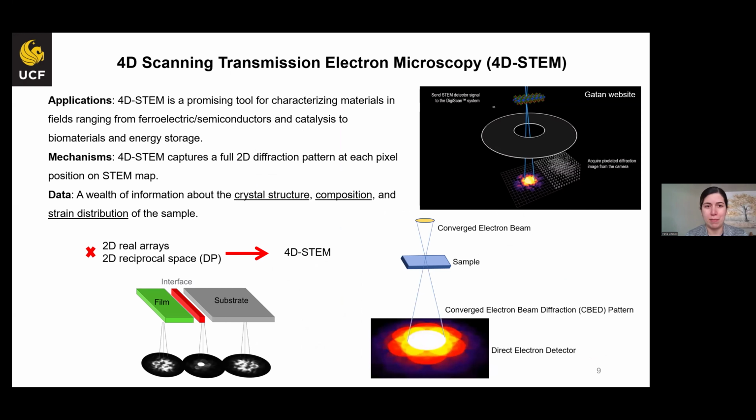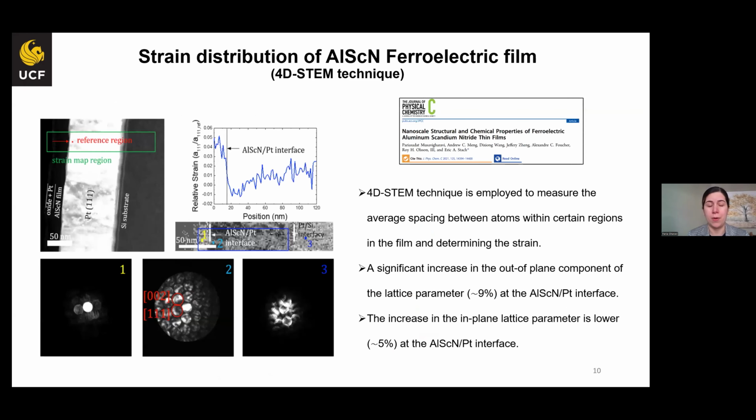However, we use 4D STEM. And I'm happy that before me, some of the speakers talked about 4D STEM, and it's a very hot technique these days to measure and characterize materials in all the fields, from ferroelectrics to semiconductors and energy materials. So using 4D STEM, we are able to get some information about the crystal structure, compositions, and strain distribution. And our purpose here is to measure this strain distribution.